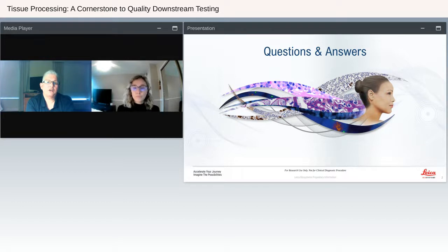Certainly, kudos that they are well decalcified. I think that's the number one issue we usually run into, is tissue's usually not. By the time you get it processed, you get all the way down, you're running into difficulties. Certainly, if it's long, I would do it at an angle, taking that impact off the blade. Water temperature, I think I forgot to mention in the presentation, is anywhere from around 39 to 41 Celsius, so that it doesn't break apart, but you're able to stretch it out. And the little alcohol trick might actually help with those types of specimens.